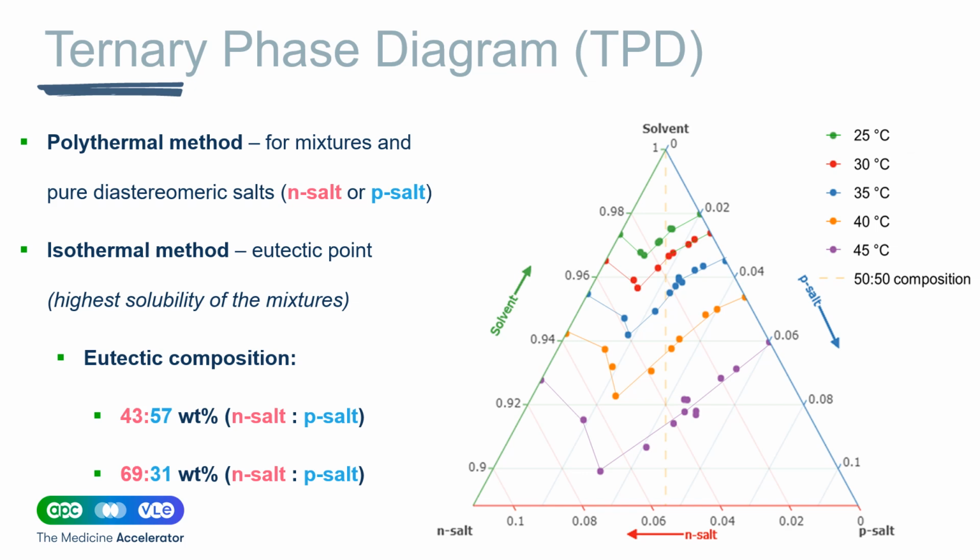To address the challenges of purity, an alternative approach was investigated, initiating recrystallization with a P salt enriched solution and heavy seeding. While this demonstrated improvements in purity, it proved economically unfeasible, limiting its practical utility. Consequently, this approach does not present a viable pathway for P salt crystallization.